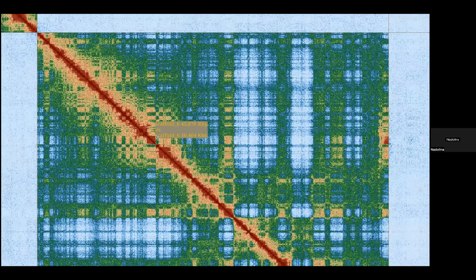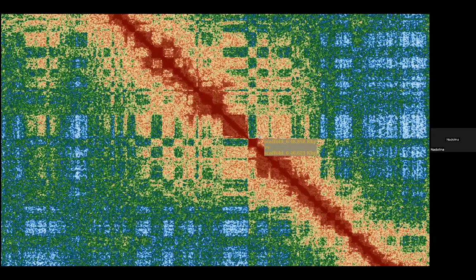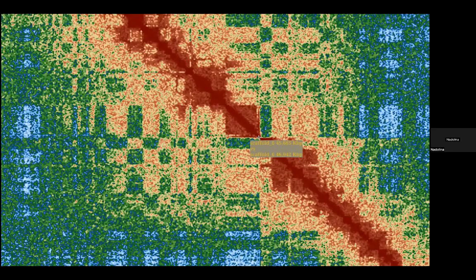So what I'm going to do is go search the TPF for this position to see if there's a gap at this position here. Because we're also going to need to annotate that. And if there's not a gap at that position, it doesn't mean that you're necessarily wrong, but it is a warning sign that you might want to investigate that a little bit further before you make that break. So what we're looking for is approximately 47 megabase pairs in scaffold 6.